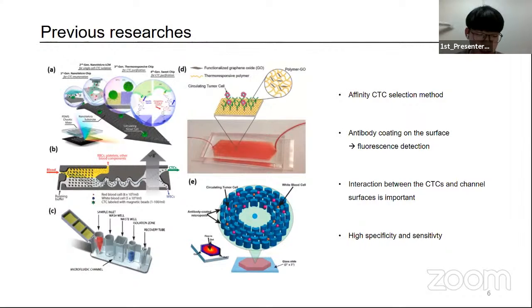Positive CTC selection is based on the capture of tumor cells using specific surface antigen selection and the exclusion of normal cells. Epithelial cell adhesion molecule is a widely used marker among all of the immunoaffinity-based positive selection approaches. The positive selection of CTCs can be achieved by either coating antibodies onto the reaction channel surface or by artificially adding antibodies conjugated to microparticles.